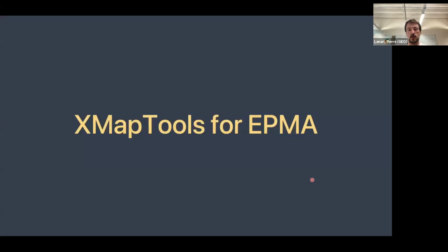So let's have a few slides on the method for EPMA. Today I really focus on XMapTools for EPMA data. I want to show you what the main steps are, what the philosophy behind XMapTools is, and how we go from semi-quantitative X-ray maps to fully quantitative compositional maps. Then in the tutorial, I'll show you how we do it practically with the program.